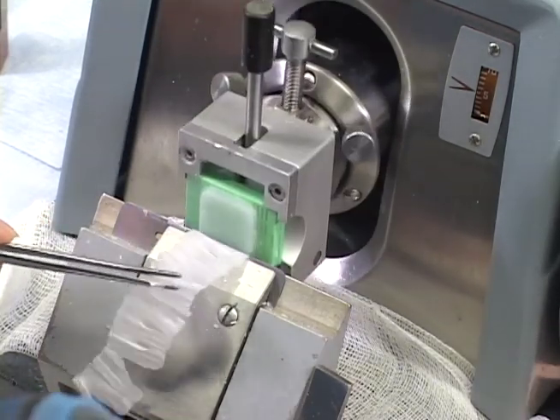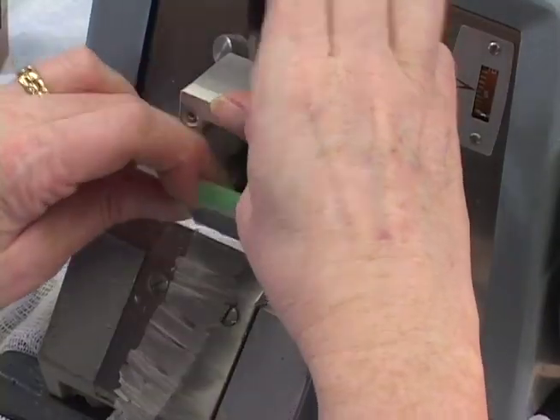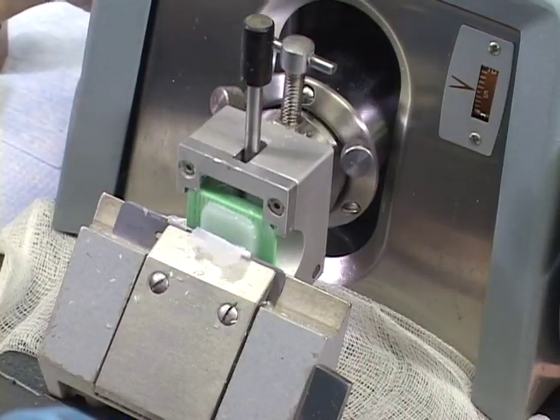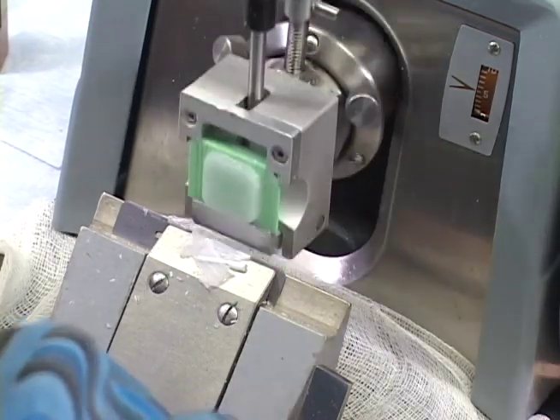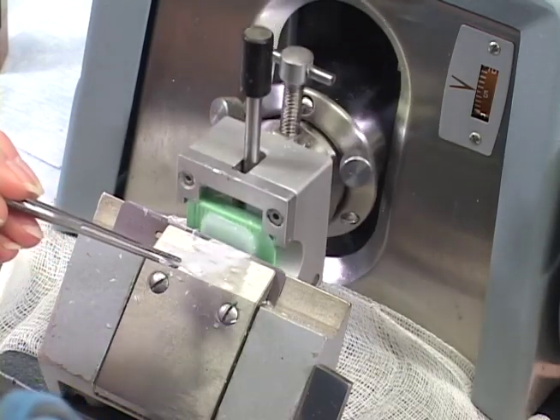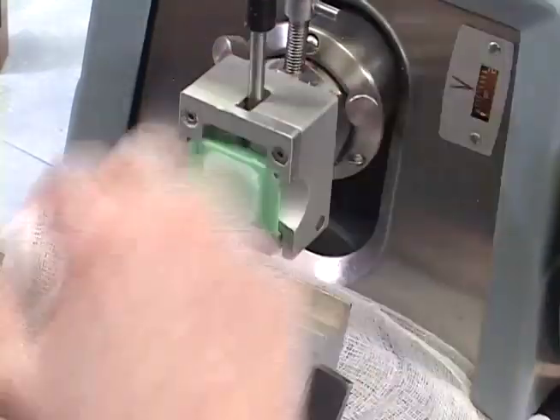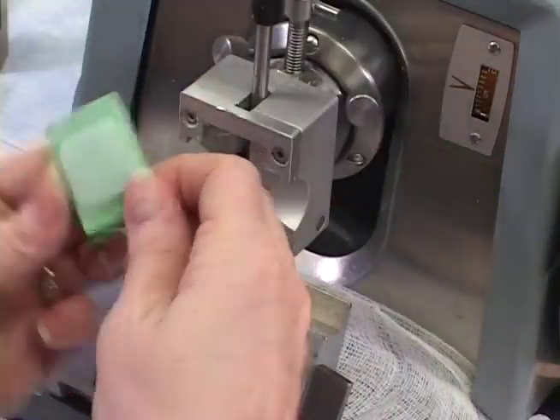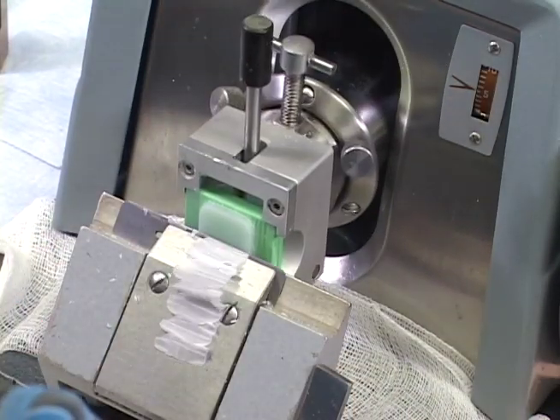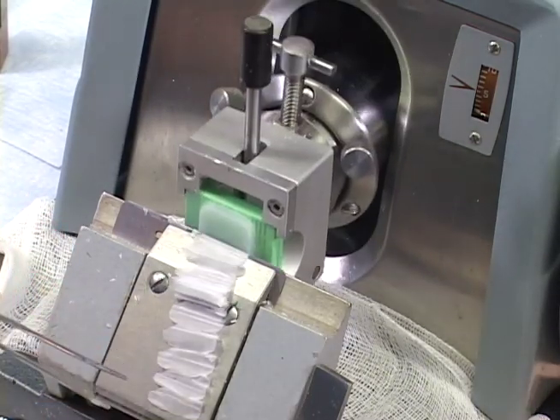Okay, so I got this side kind of even. So now I'm going to flip the block again and see if it is similar. And if it's probably within a few sections of being the same, then that's pretty good. And it's pretty close. I almost would think that that's acceptable. And if I flip it again, it should be pretty close again. Maybe just a little bit, but that's pretty close. You should have a pretty even block face with that.